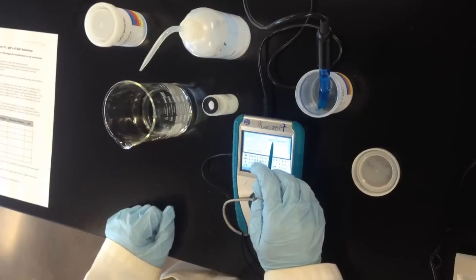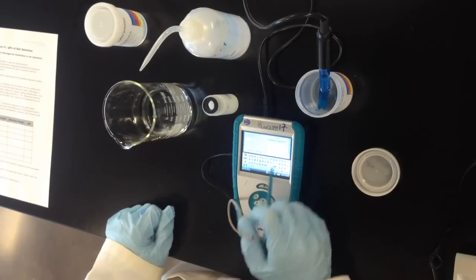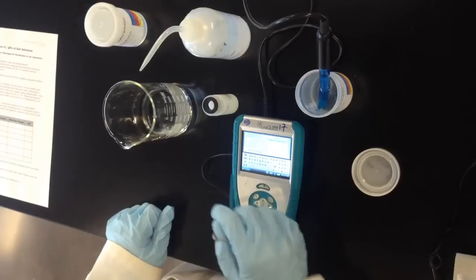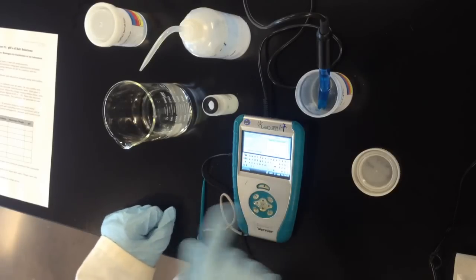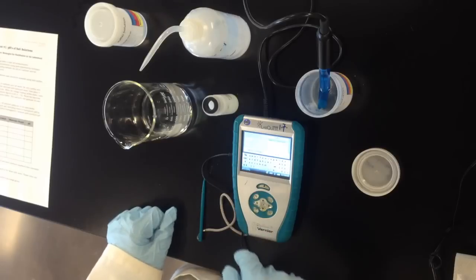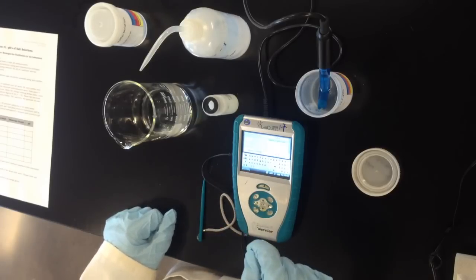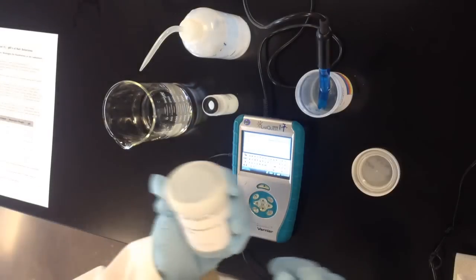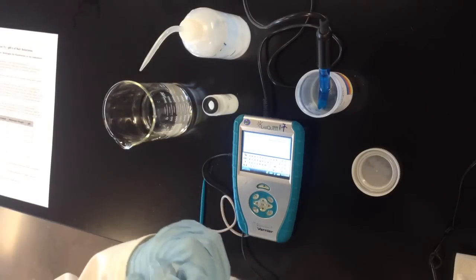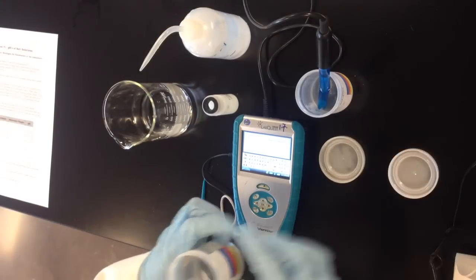We can hit that and that'll register the voltage which here is 2.40 volts. That's associated with a pH reading of 4.00 and notice that that's different from the pH reading we saw before we calibrated. The next step is to move it over to the pH 7 buffer and register the true value there as pH 7.00.